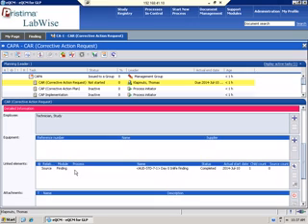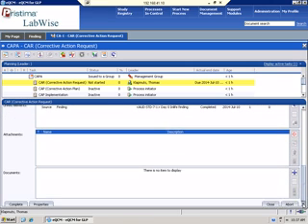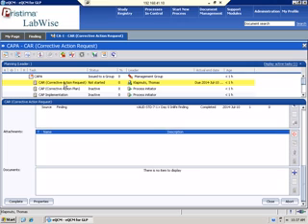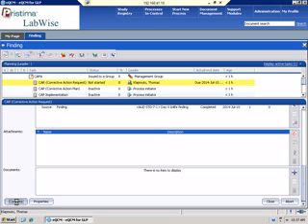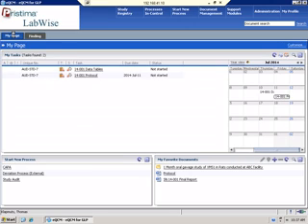The linked element is the finding, so it has the information on the finding, the start date. If there's any attachments you want to apply, any documents. And so now I'm just doing the corrective action request. So when I hit complete, that'll go ahead and launch the CAPA through its life cycle.